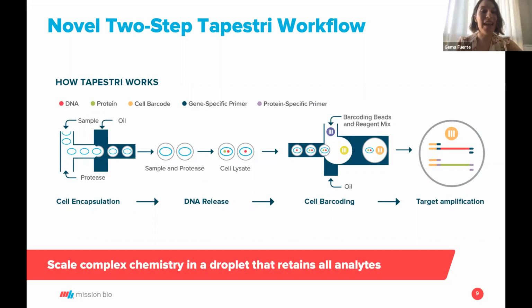I see. Yeah. So we have a universal nuclei isolation protocol that outlines step by step how you get to single nuclei from frozen tissue. You start by mincing the tissue, then we have some collagenase and dispase enzymes to release these single nuclei, and we also need to clean the solution and probably pass it through a strainer if we see there is debris or the nuclei are not in a monodispersed solution.